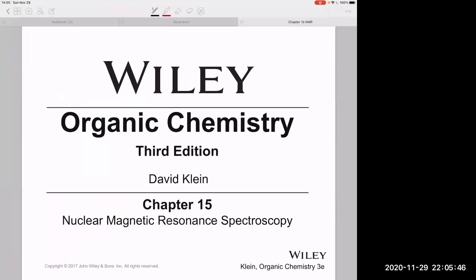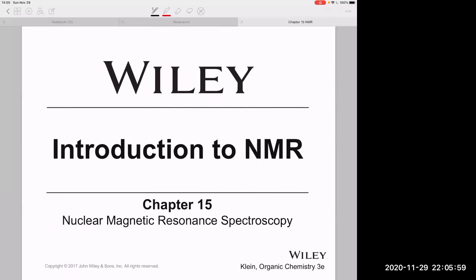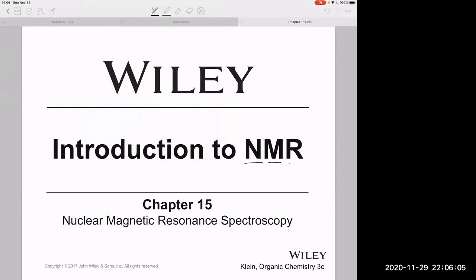All right, everyone. So this is officially the last topic of new stuff that we're going to cover in this Organic Chemistry 1 semester. This is our lab topic. So this is going to be an experimental technique known as nuclear magnetic resonance spectroscopy, more affectionately known as NMR.